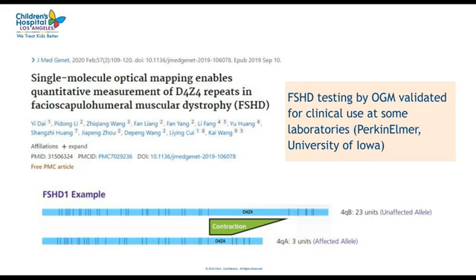And short-read sequencing also doesn't work very well because reads from repetitive regions cannot be mapped back to the genome. But optical genome mapping provides the advantage that you can directly visualize these repetitive regions in long DNA molecules, and you can really efficiently detect and study repeats.